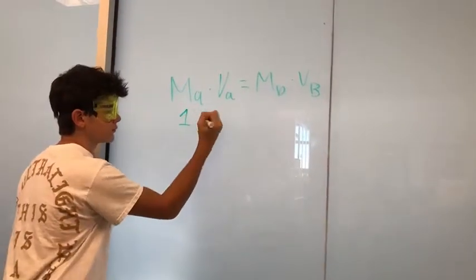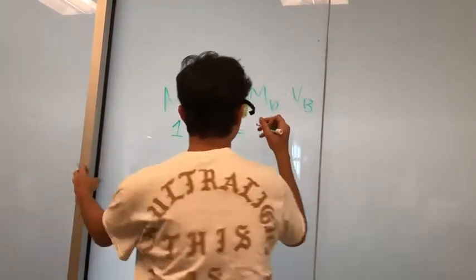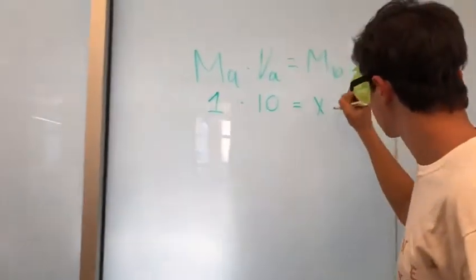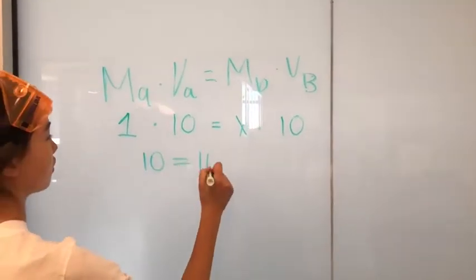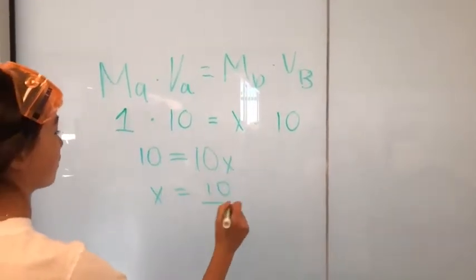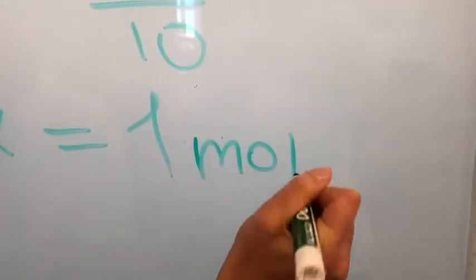How to calculate the unknown concentration of the analyte. The acid molarity times the volume equals the base molarity times the volume. Volume can stay in milliliters, but it must be for both volumes. This equation works best with a strong acid and a strong base. And don't forget your goggles.